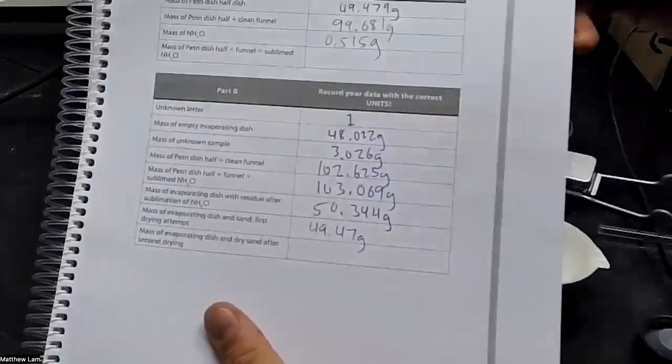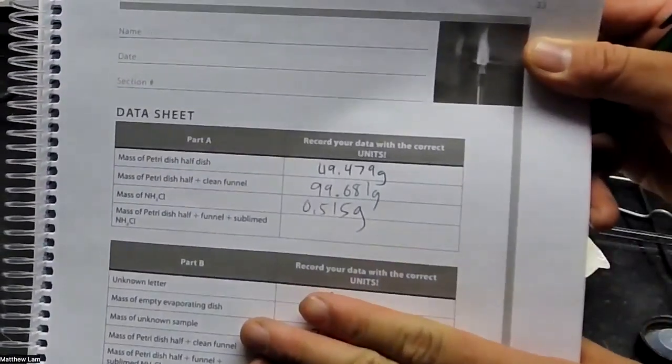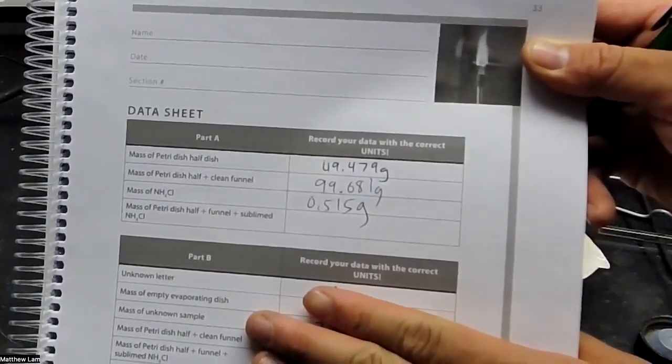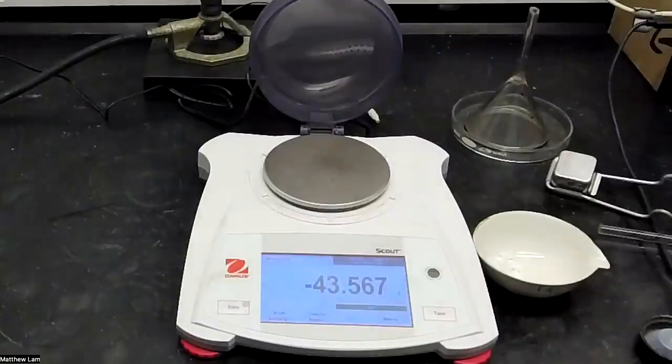So 0.515 grams. Before we start the experiment, we took all of our pre-data here. We measured the half dish, the half dish with a clean funnel, and the mass of ammonium chloride.